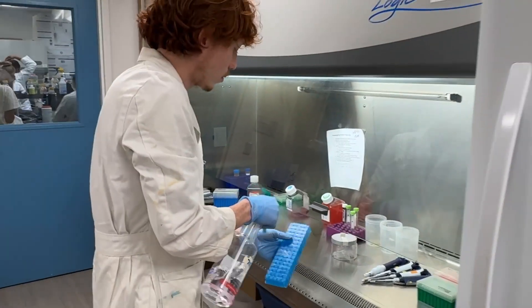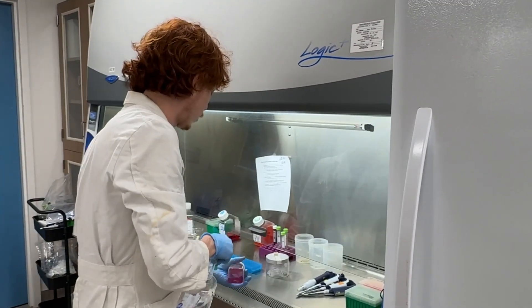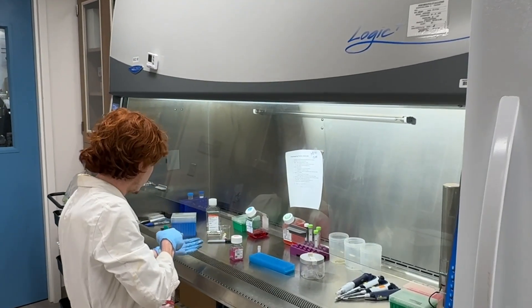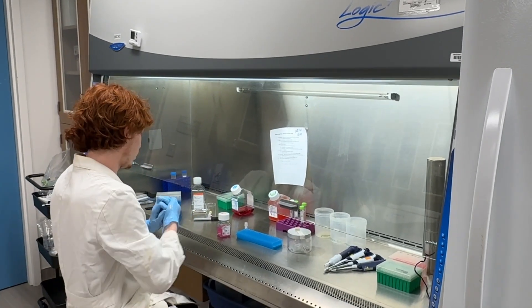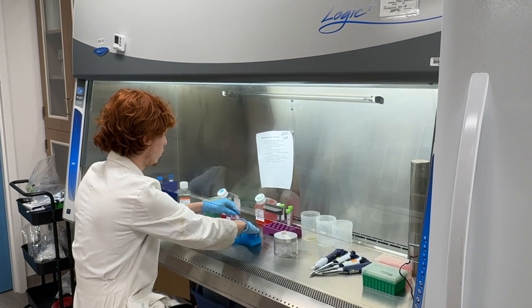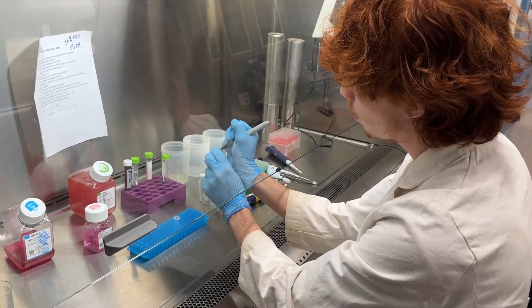Working with human cells, cleanliness is key to everything. Everything that goes into this hood gets sprayed down. Here is Spencer spraying down the racks with ethanol, spraying down any bottle that goes in there, and then doing a quick spray of his hands as well before entering — just being mindful of airflow to keep a clean environment.